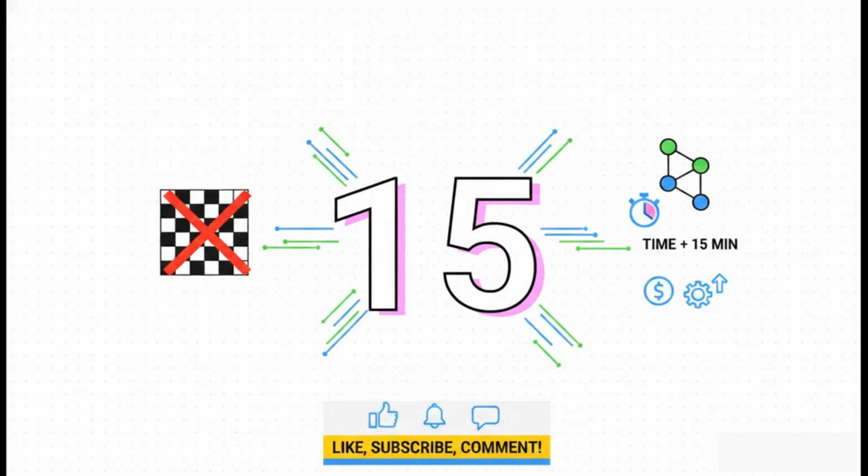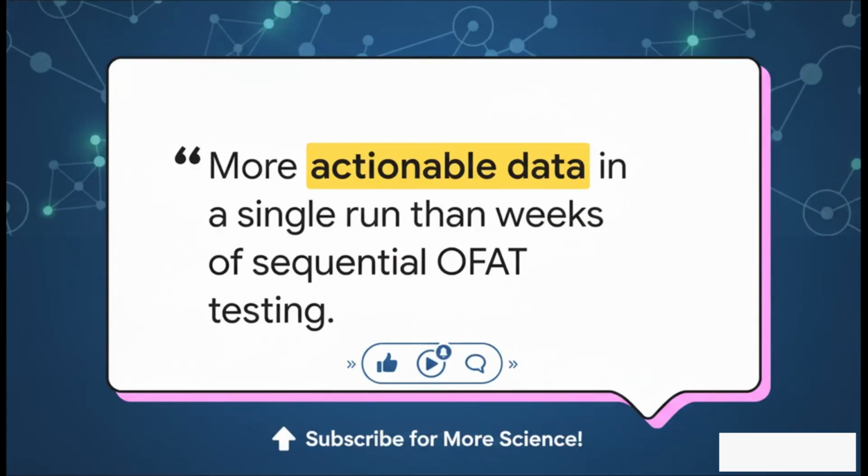These kinds of hidden cost-saving insights are literally impossible to glean from a standard 2D checkerboard, simply because they depend entirely on how those two variables interact with each other. There is a quote here that perfectly sums up the sheer efficiency and speed of this mathematical modeling approach. A well-designed fractional factorial can provide more actionable data in a single run than weeks of sequential OFAT testing.